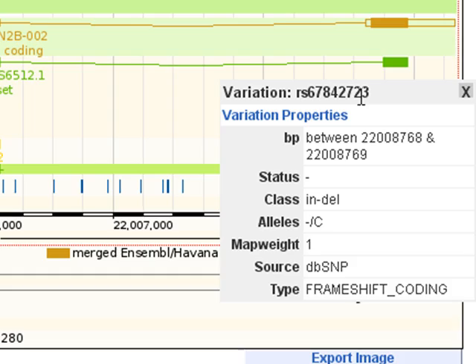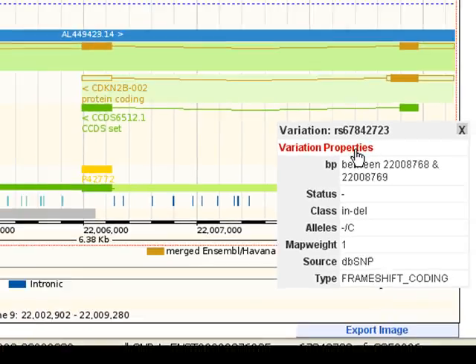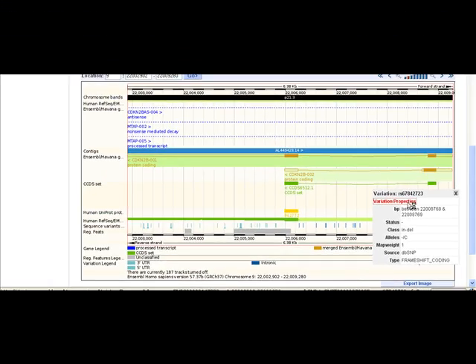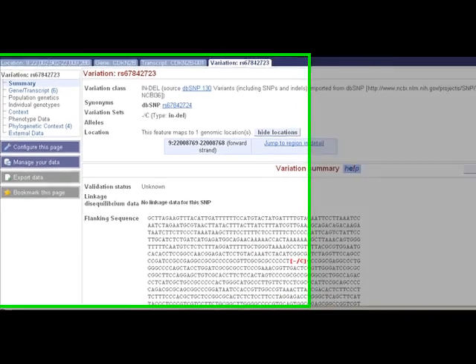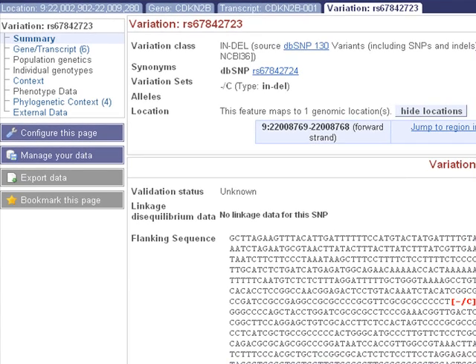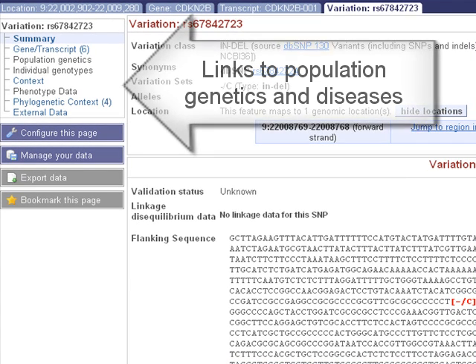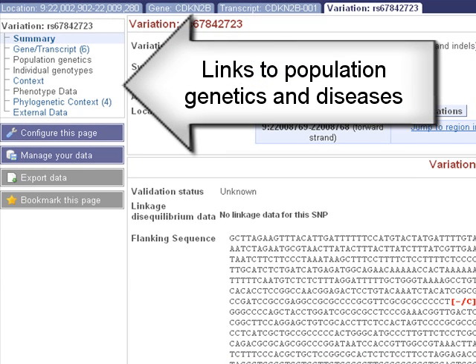This type of box appears when you click a variation from other pages as well. Let's follow the link to variation properties. A fourth tab has now opened. Explore the links at the left to see more information about this variation, such as population studies or disease association.